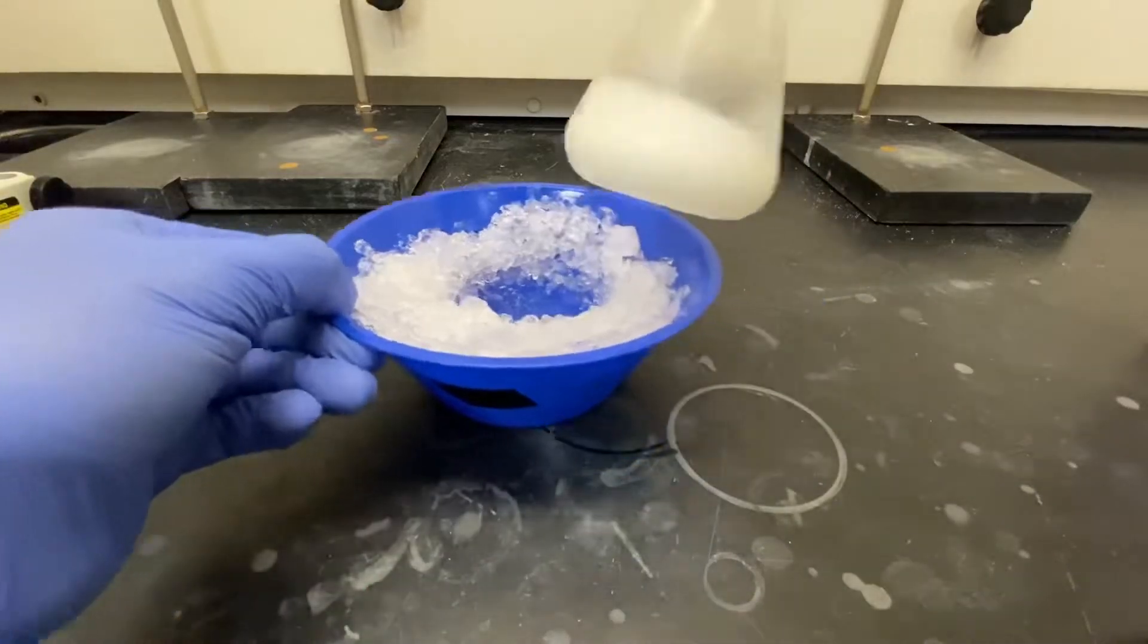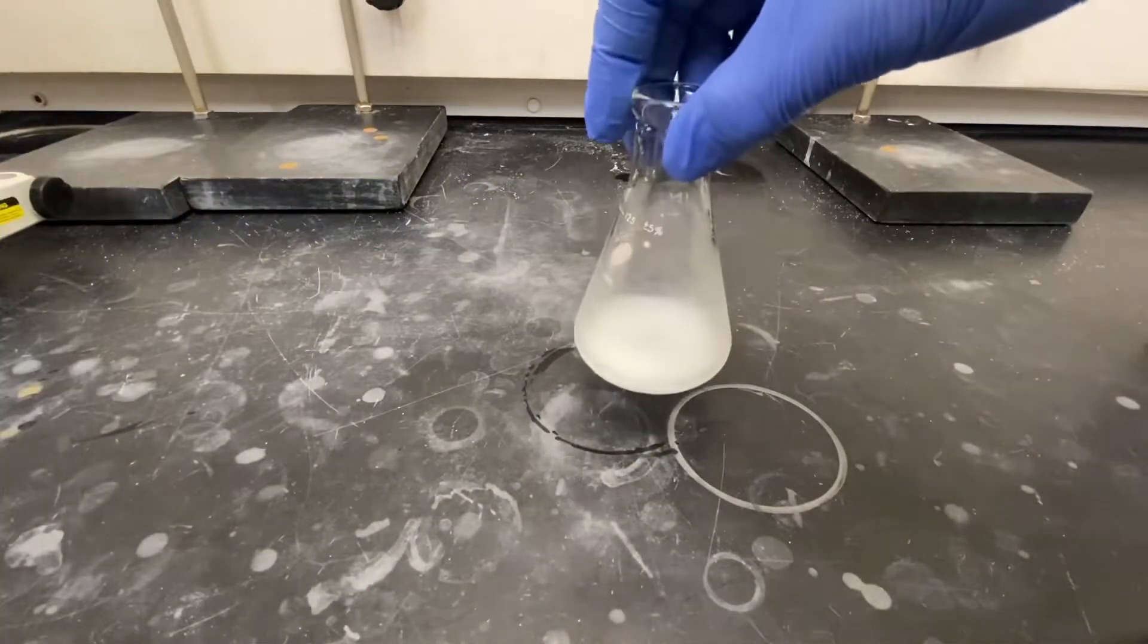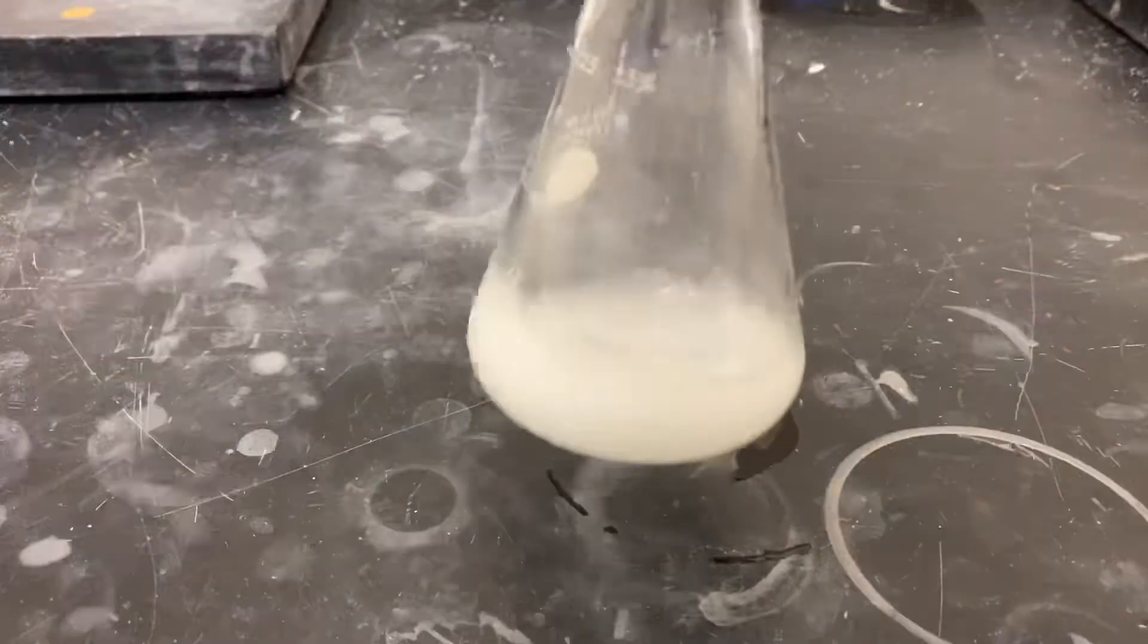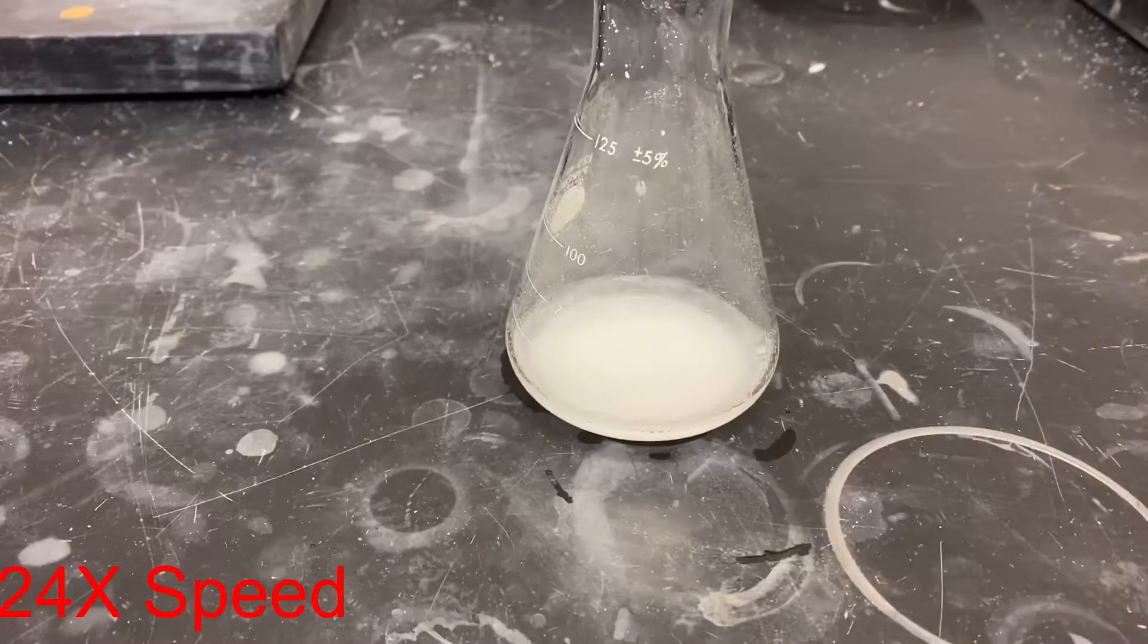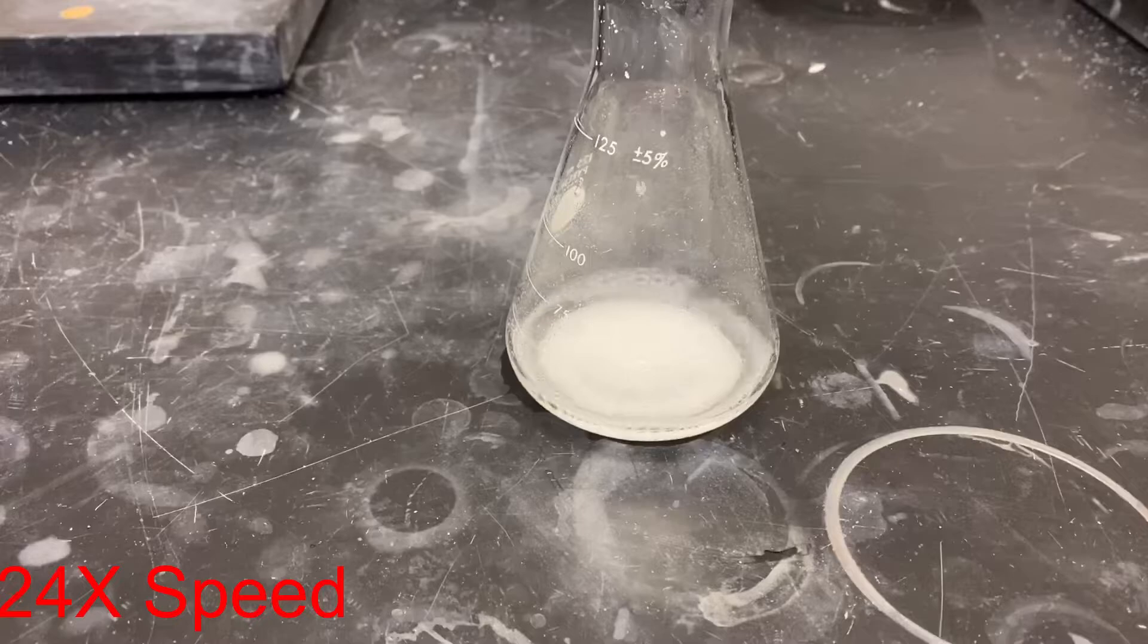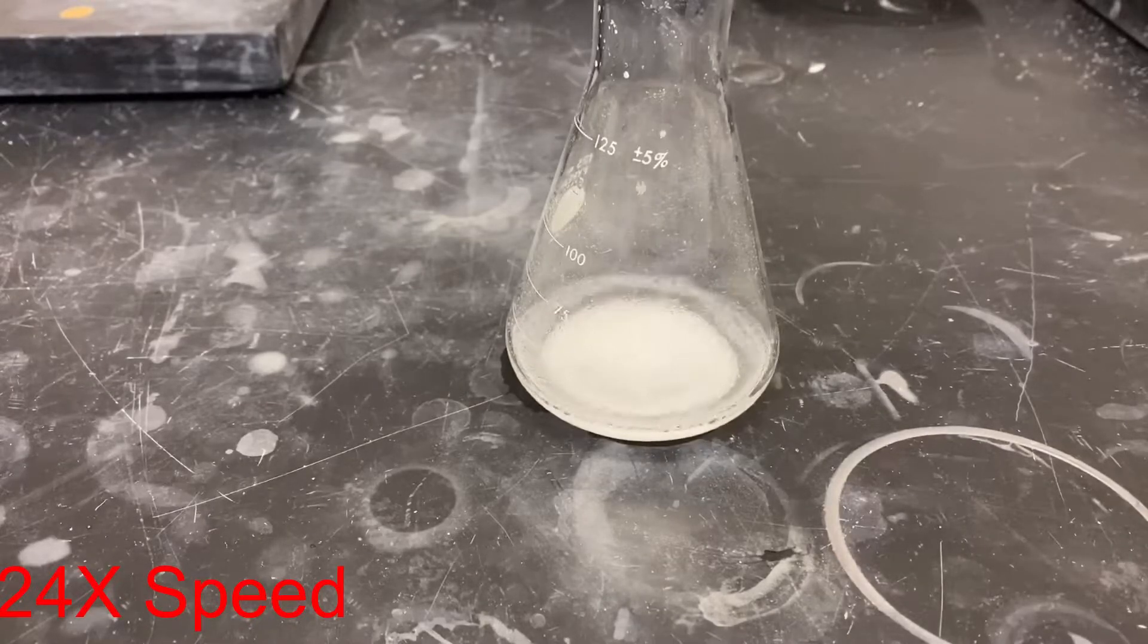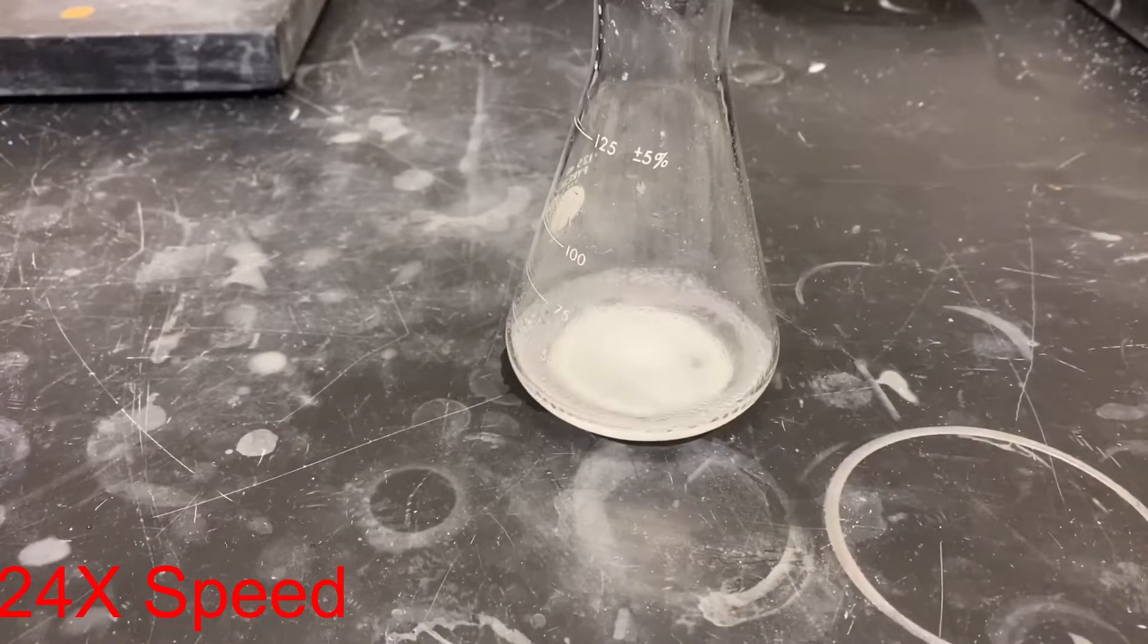After all sodium borohydride is added to the chalcone mixture, remove the Erlenmeyer flask from the ice bath and let the mixture warm to room temperature while it is reacting. While it is warming up, swirl the Erlenmeyer flask to mix from time to time. During the reaction, bubbling in the mixture was observed due to the generation of hydrogen gas.